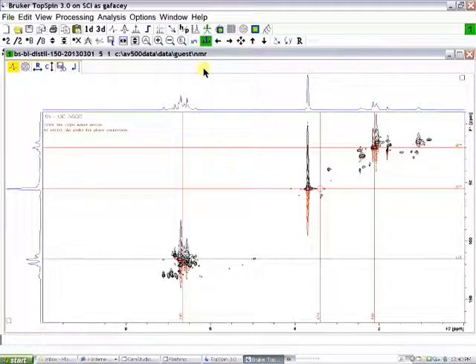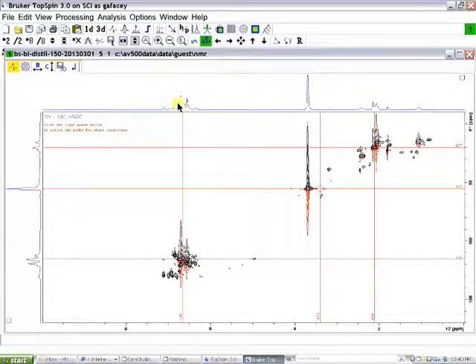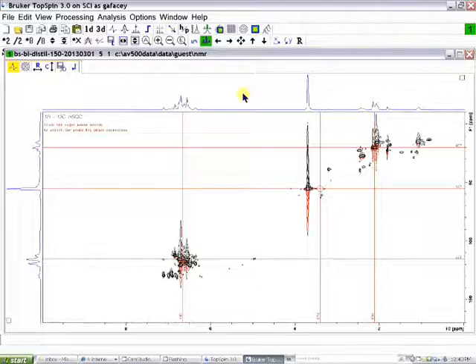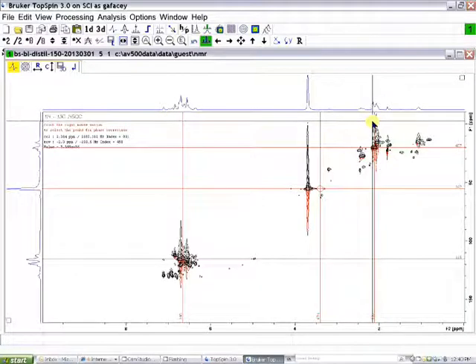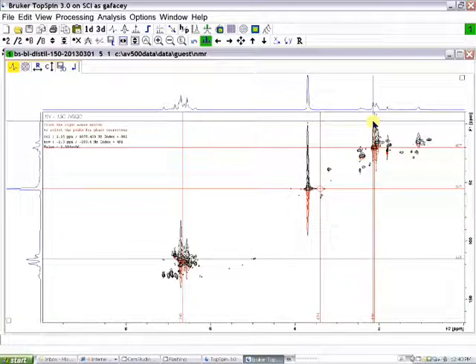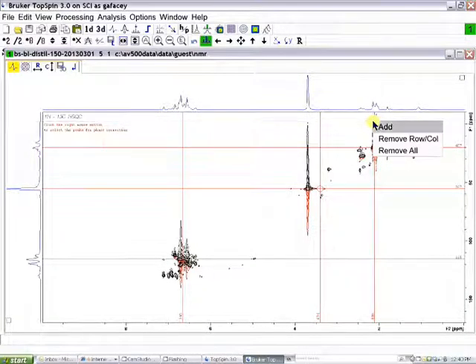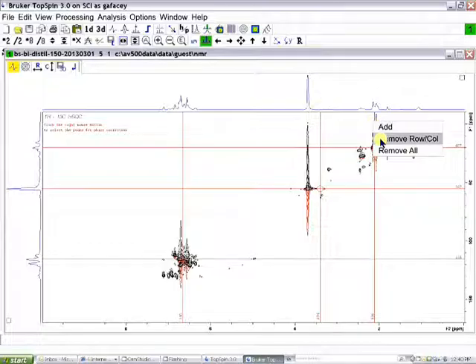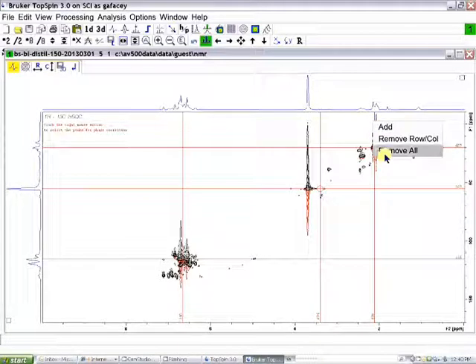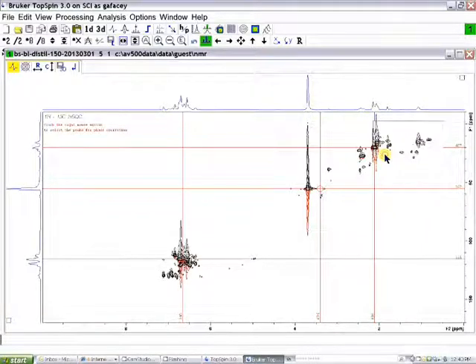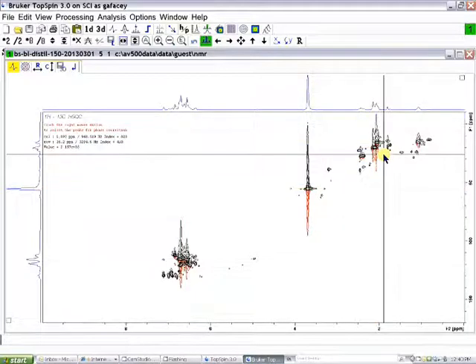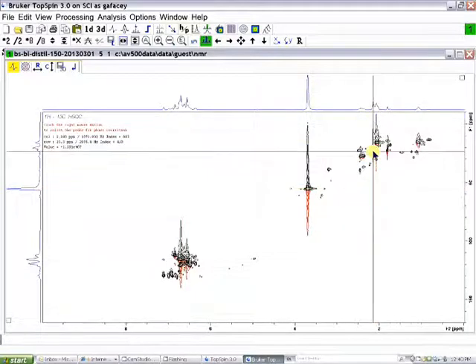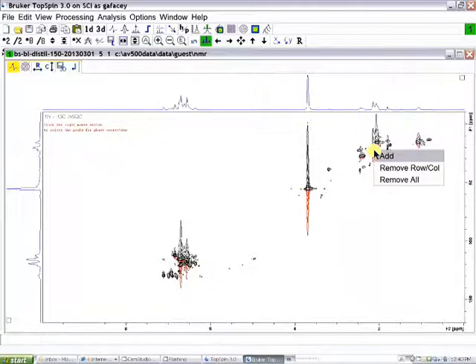Now you can see that the rows are phased, but the columns are not phased. To phase the columns, you'd first click on a signal with the right-hand mouse button. You could say Remove All. This will remove the three rows that we've selected. And then right-click again on a large signal.